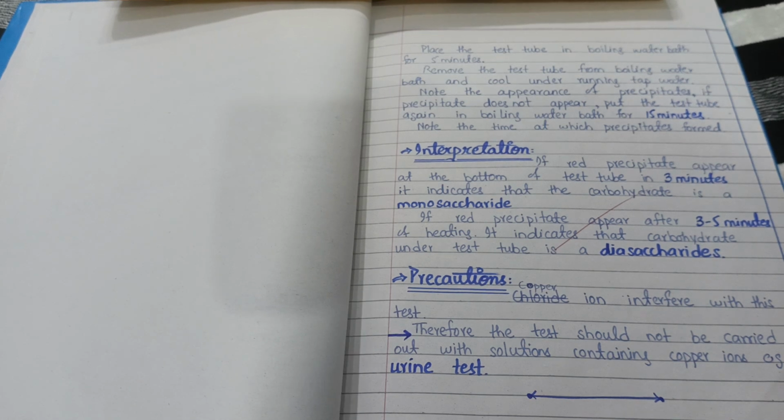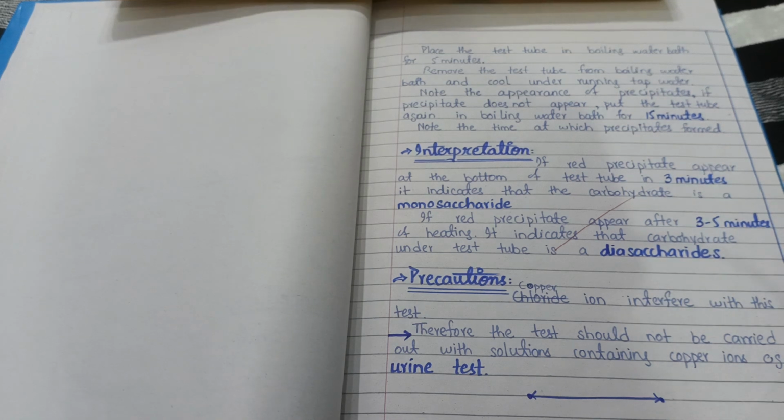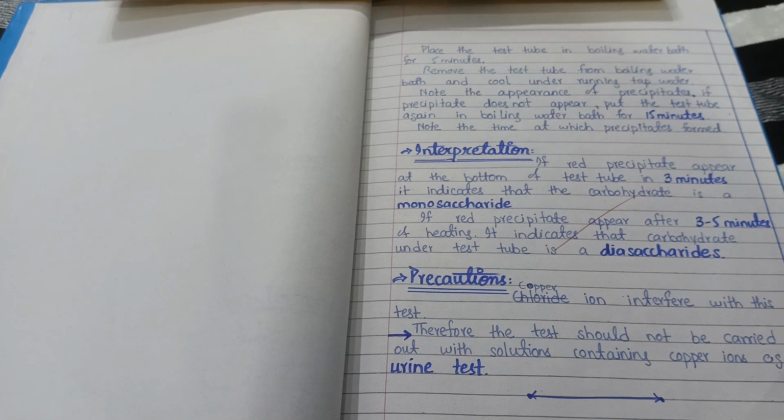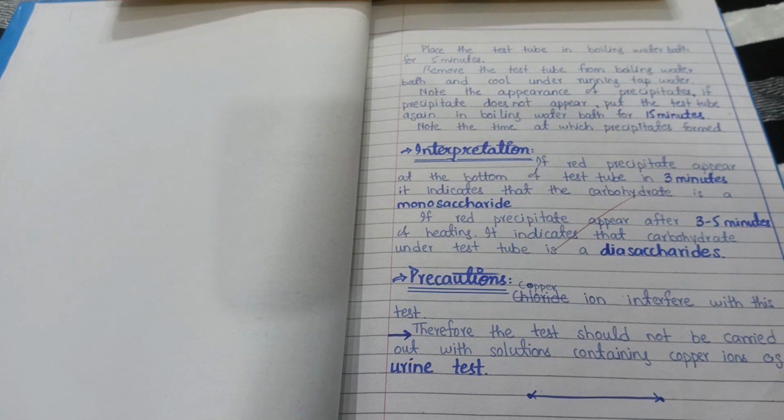The iodine test is only for polysaccharides, and it has some conditions. For example, it cannot take place in the presence of base, it cannot take place at high temperature, and it needs a constant and balanced temperature. Second thing is that for the Barfoed reagent, we see there is a reduction reaction. Your cupric ion is going to reduce into cuprous oxide. So Barfoed reagent is used to distinguish monosaccharide and disaccharide.